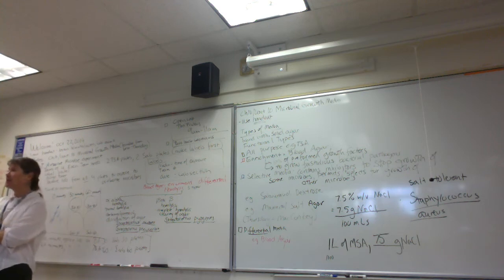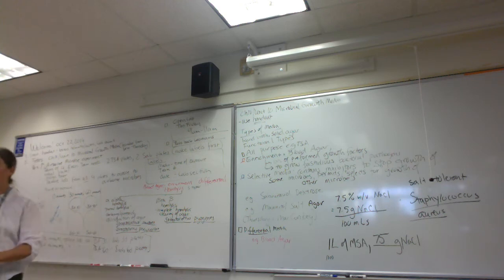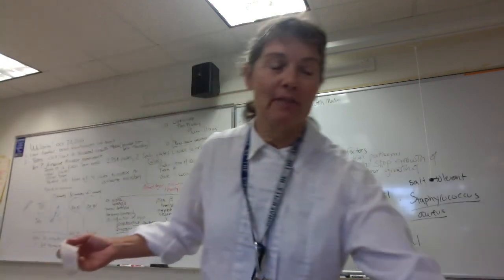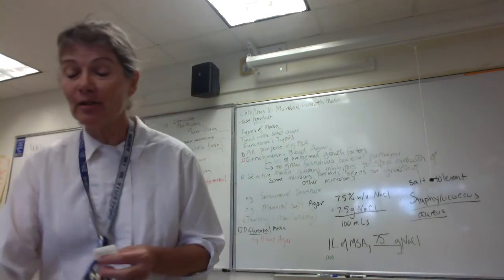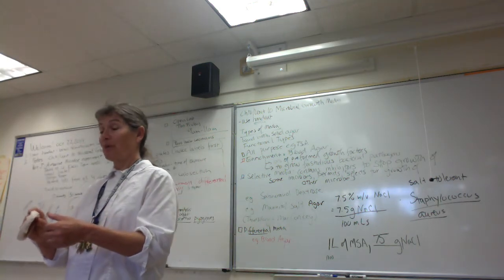Now, it's not a surprise, folks, because as adults, probably 10-15% of us carry Streptococcus pyogenes in our throat without any clinical signs or symptoms, right? So we have a really high symptomless carrier rate. Now, what I'll do is I'll ask your colleague whose throat sample this was if they have a sore throat. And if they have a sore throat, I'm going to recommend they go to the doctor because it might be Strep pyogenes.